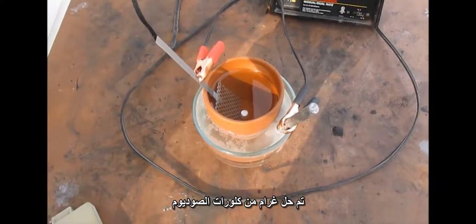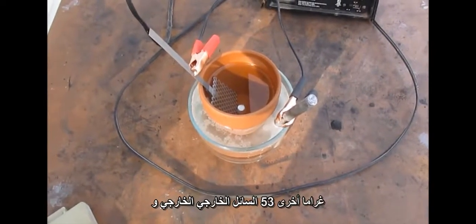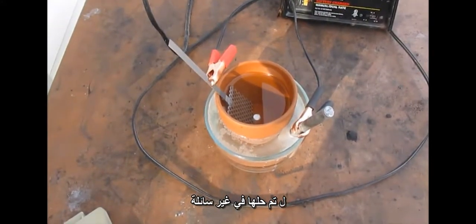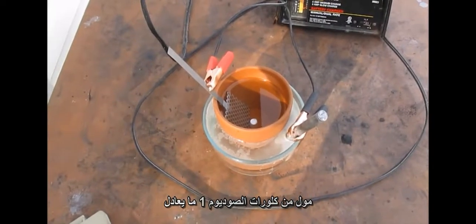53 grams of sodium chlorate was dissolved in the cathode compartment, which is the outer liquid, and another 53 grams was dissolved in the anode liquid, equivalent to 1 mole of sodium chlorate.